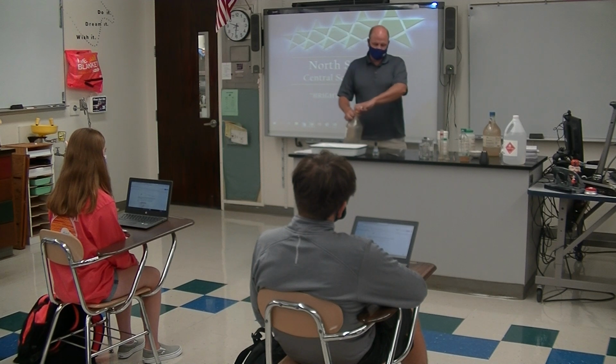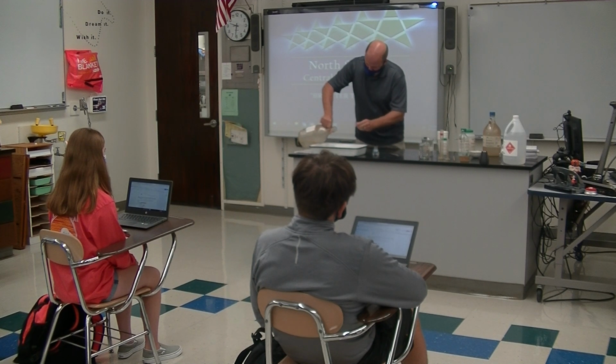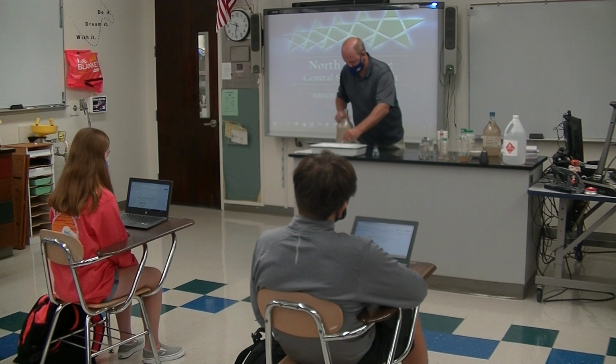So I'm going to take that sulfuric acid. I'm just going to use the pipette if I can. All right, so I just sucked up some sulfuric acid. I'm just going to put it, there's a paper towel down here. I'll show it to you in a second.